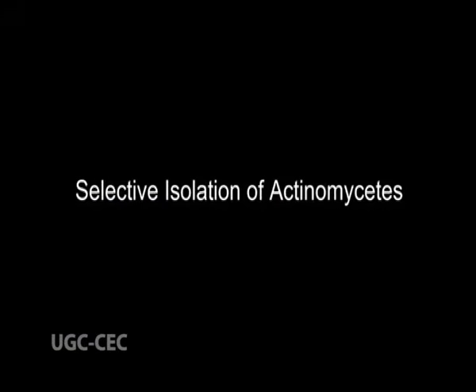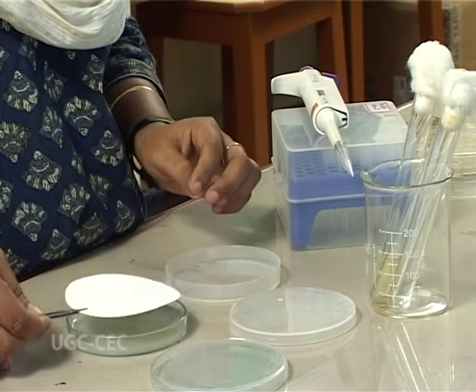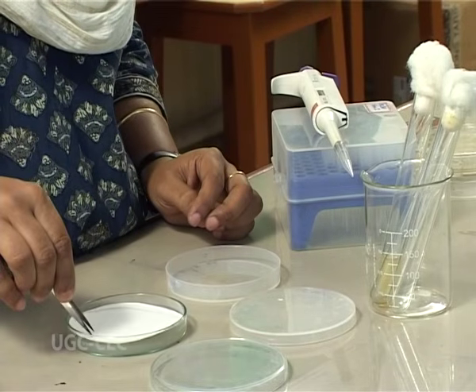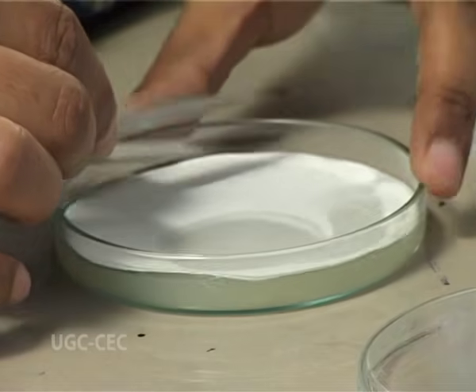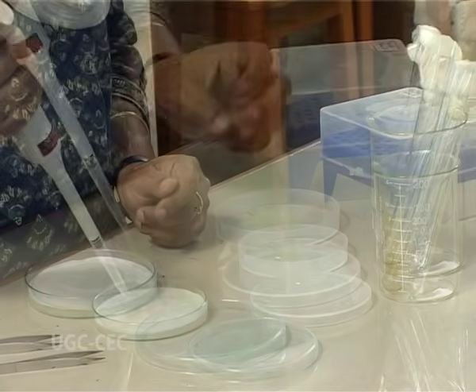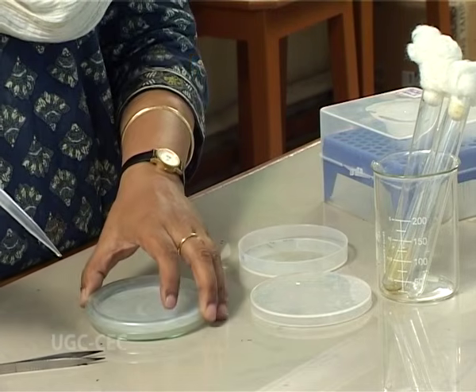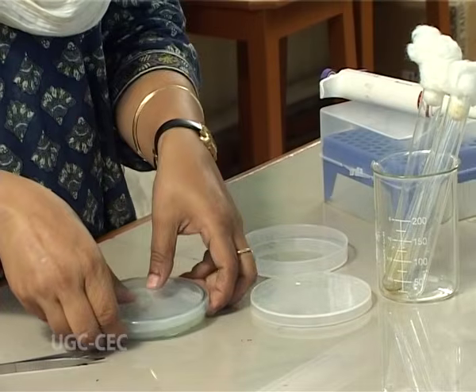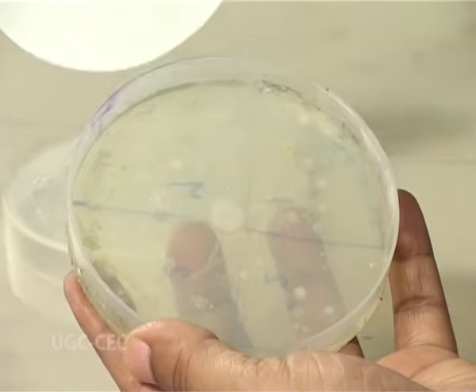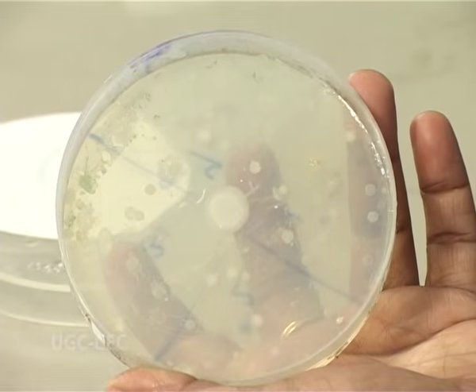In this technique, you have a nutrient agar media, and onto the surface of the nutrient agar media we put a cellulose ester membrane which has got a pore size of 0.2 to 0.45 micron diameter. If we put the inoculum onto the surface of this membrane, the actinomycetes which grow out their filament structure will be able to penetrate the nutrient agar media, while rest of the bacteria will not be able to penetrate and they will not grow onto the surface of the agar media. So, after incubation, simply take out the membrane and you will see the growth of actinomycetes only, because they show a mycelial structure.